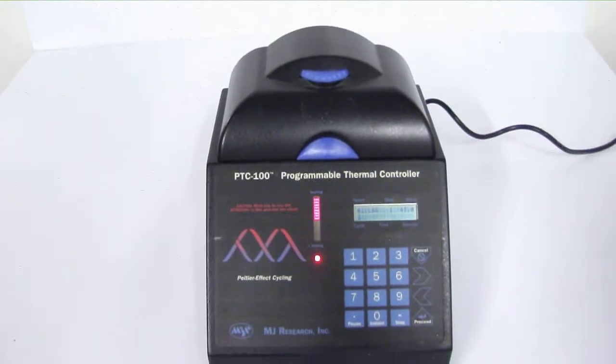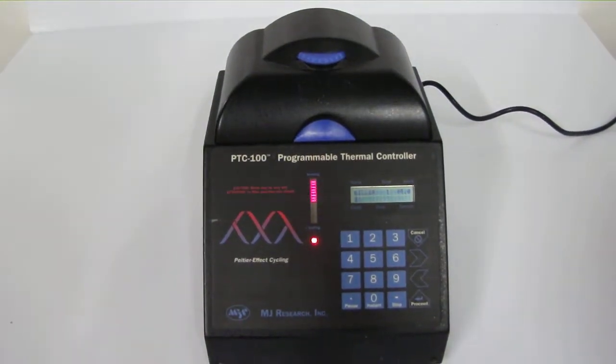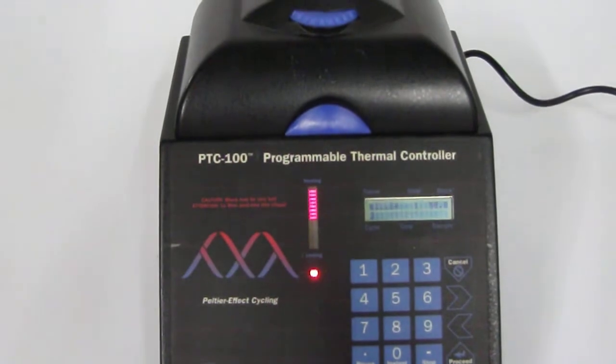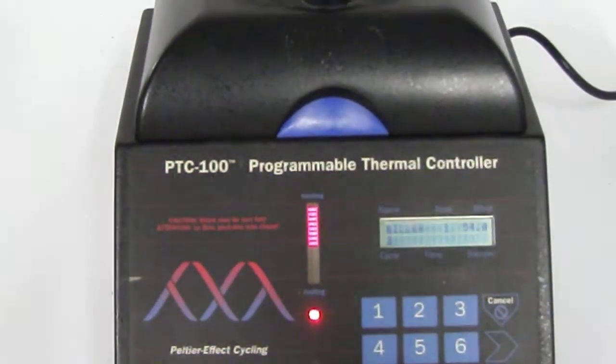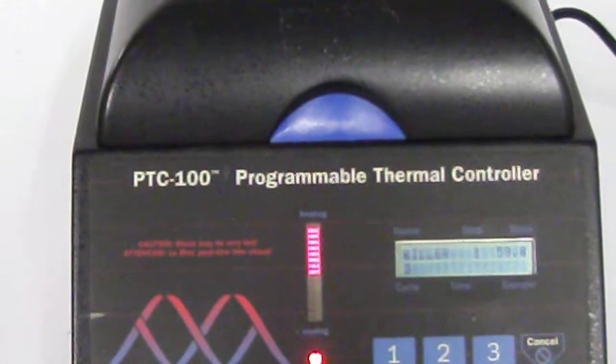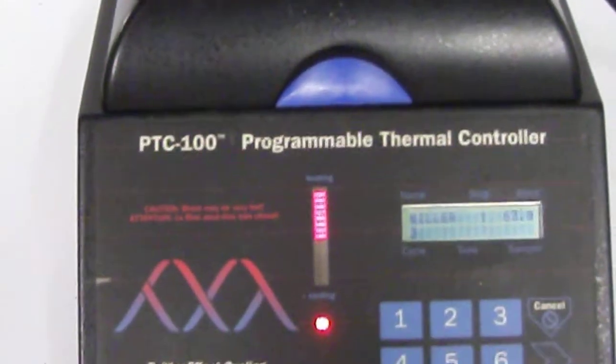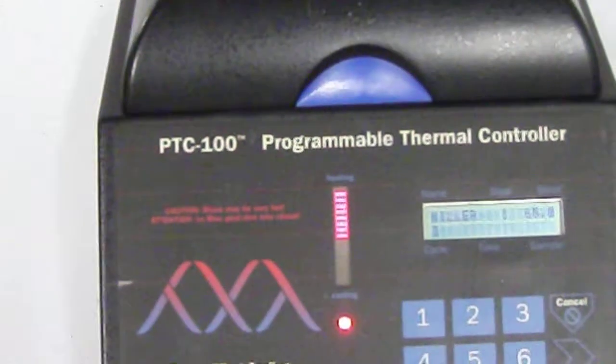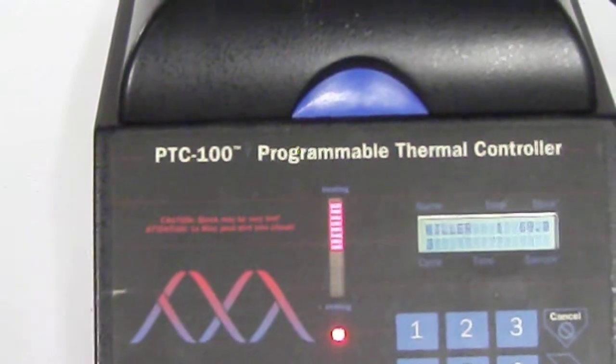In addition, it has the following features. Peltier Effect heat pumps, robustly designed for repeated cycling, deliver the full temperature range of 0 to 100 degrees Celsius electronically with speedy ramping rates of up to 2.5 degrees per second.